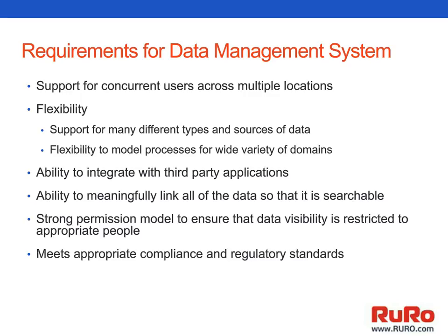Once you have all this data and it's linked in your system, having a strong search engine that's flexible and powerful is going to make it possible to do the data mining that you're looking for. So having searchability is obviously a key feature.